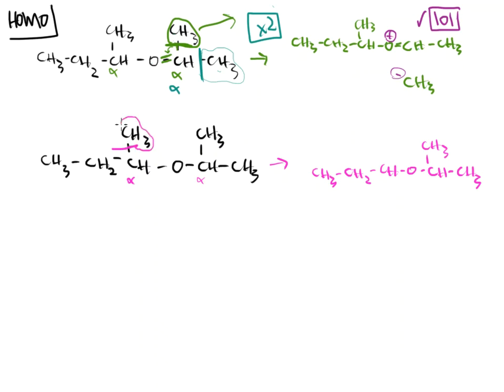When this piece gets cleaved off, it's on its own. Those electrons move in and create a double bond, just like it did up here, just like it did in the halogen cleavage. That's the typical homolytic cleavage that we always see. And when that happens, oxygen gets oversaturated, too many bonds are there, too many electrons are there, and that gives us a positive.